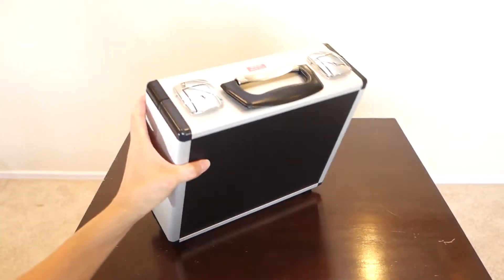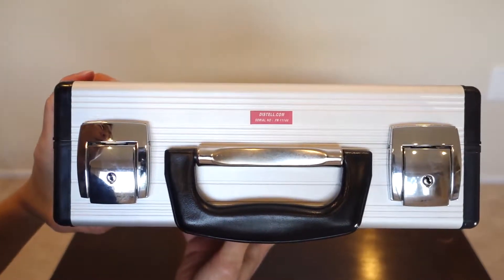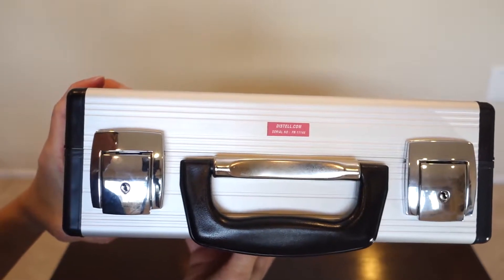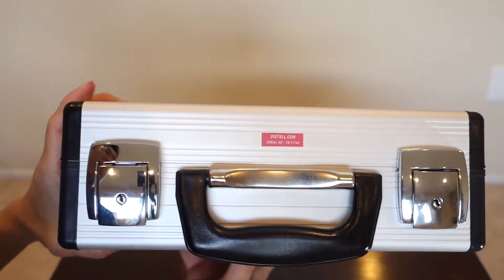One last thing about this box — up close, it's got a distell.com label and a serial number. With the serial number, you can go and trace how old or new these Torrymeters are.